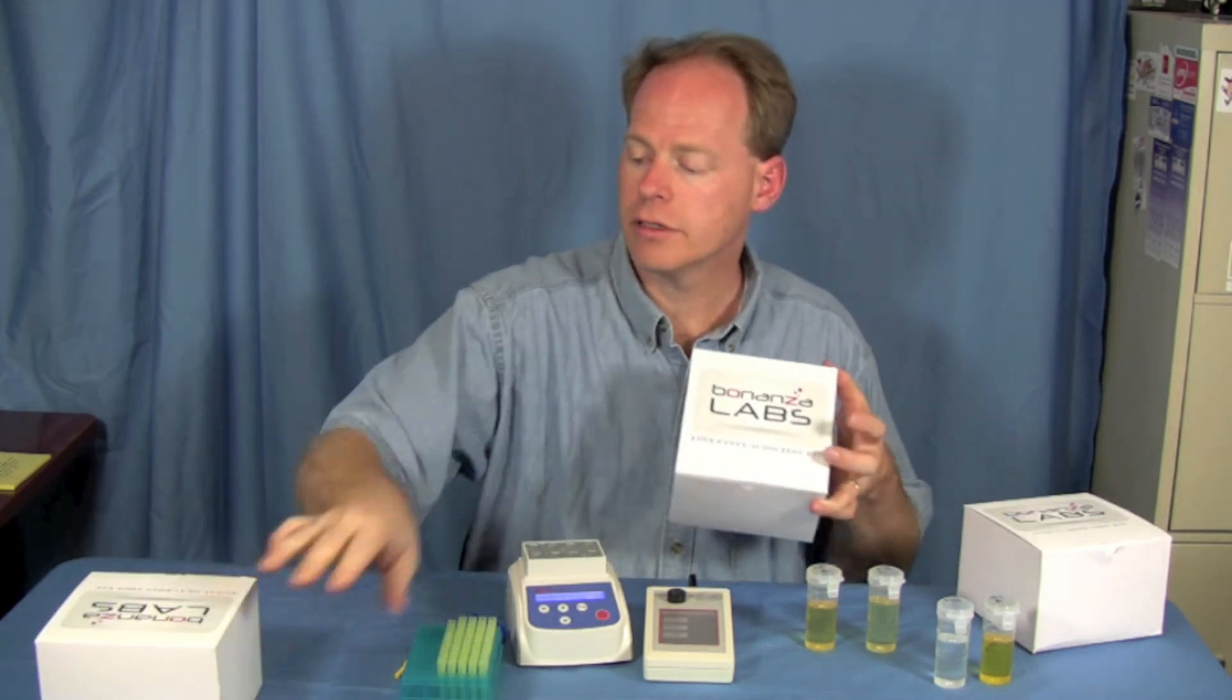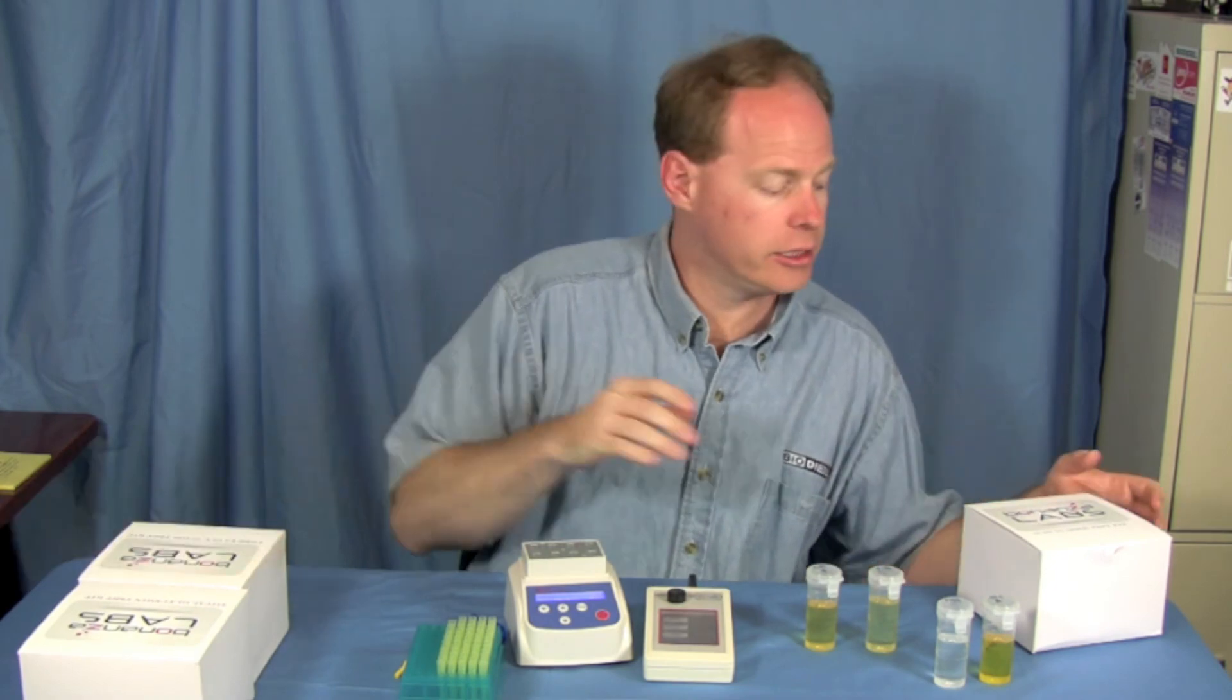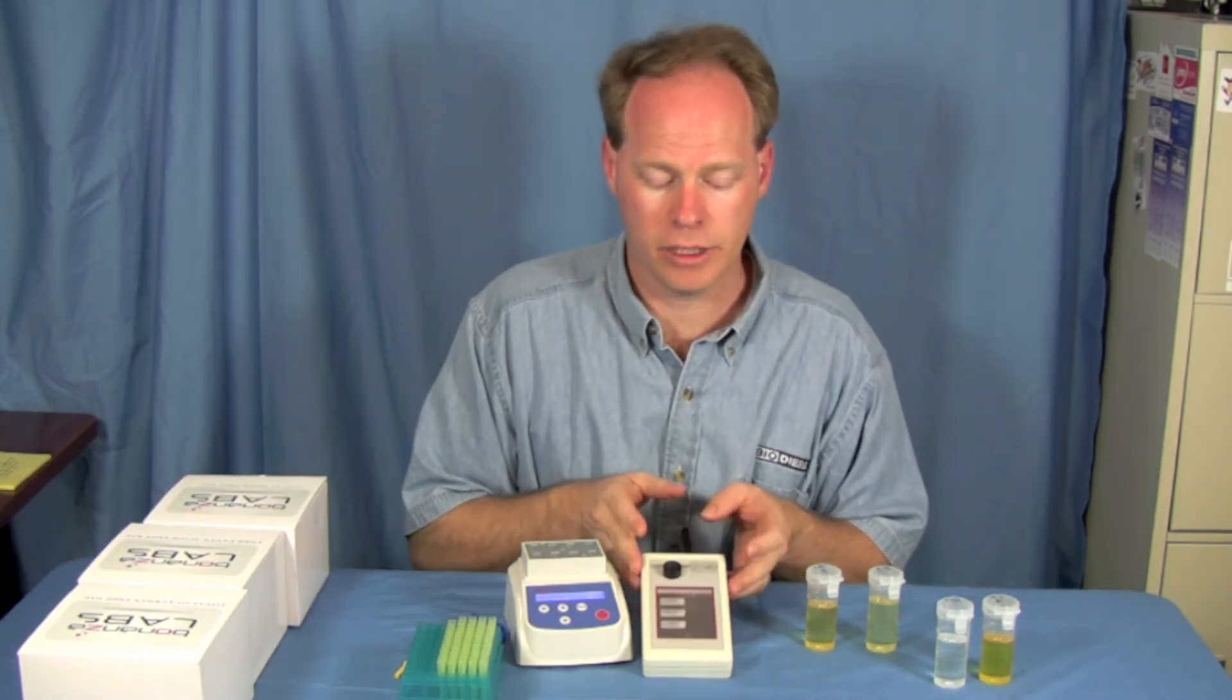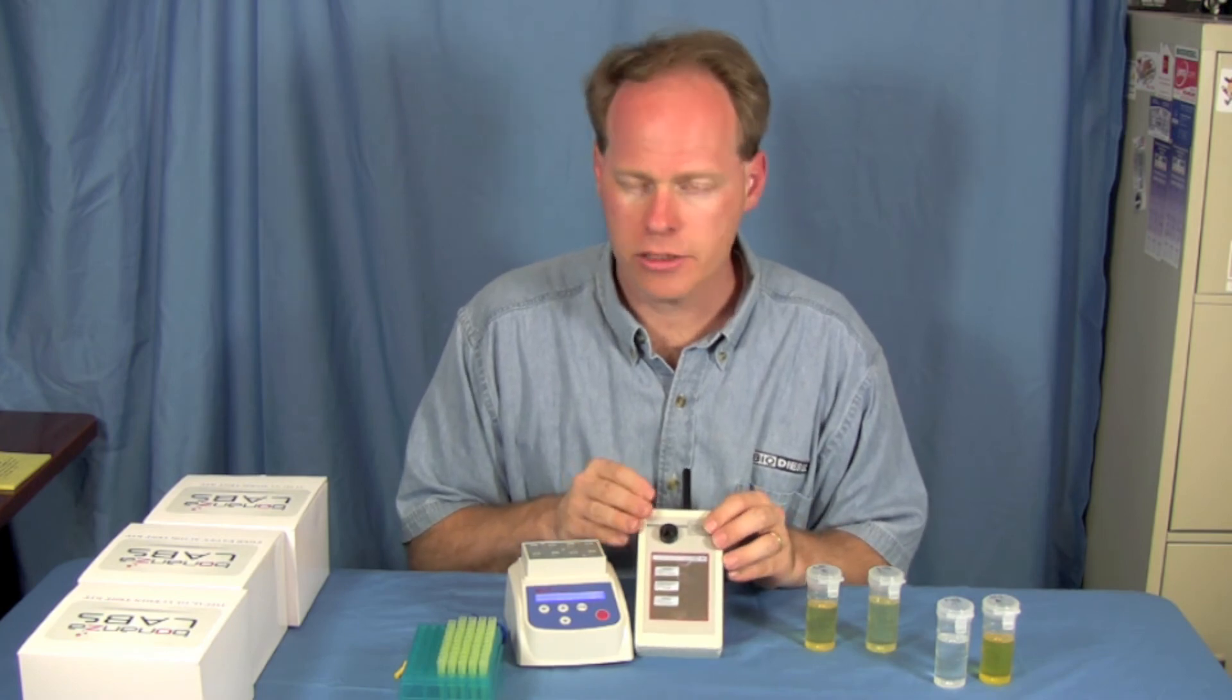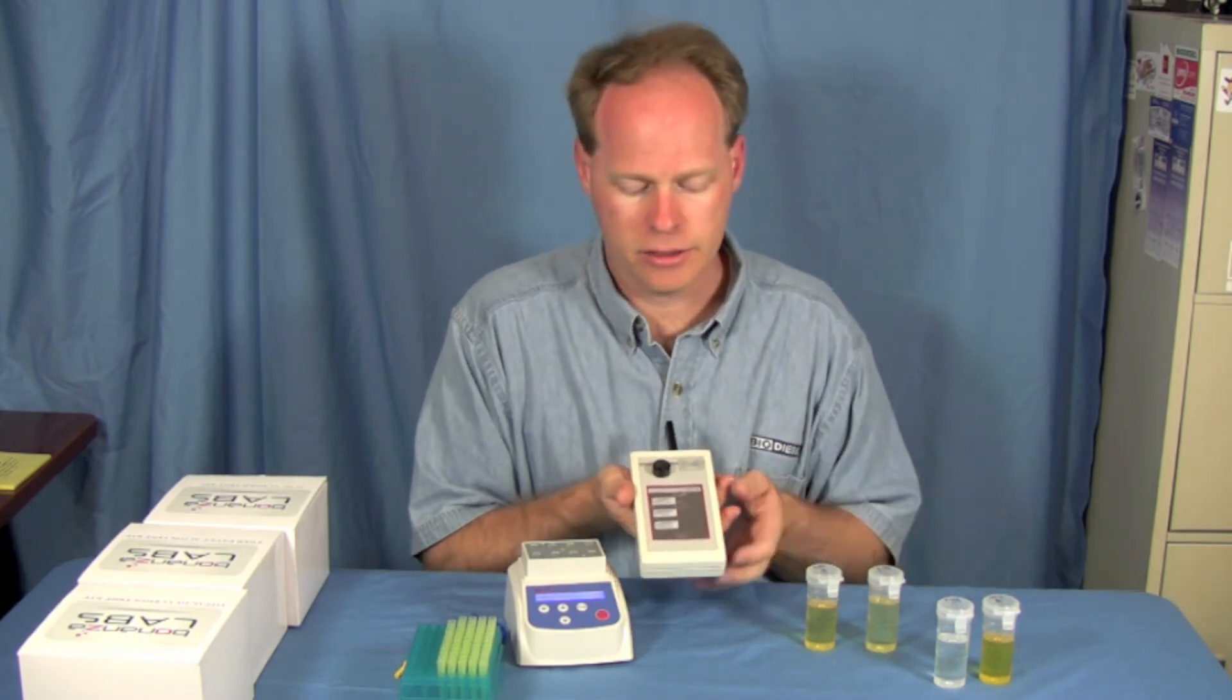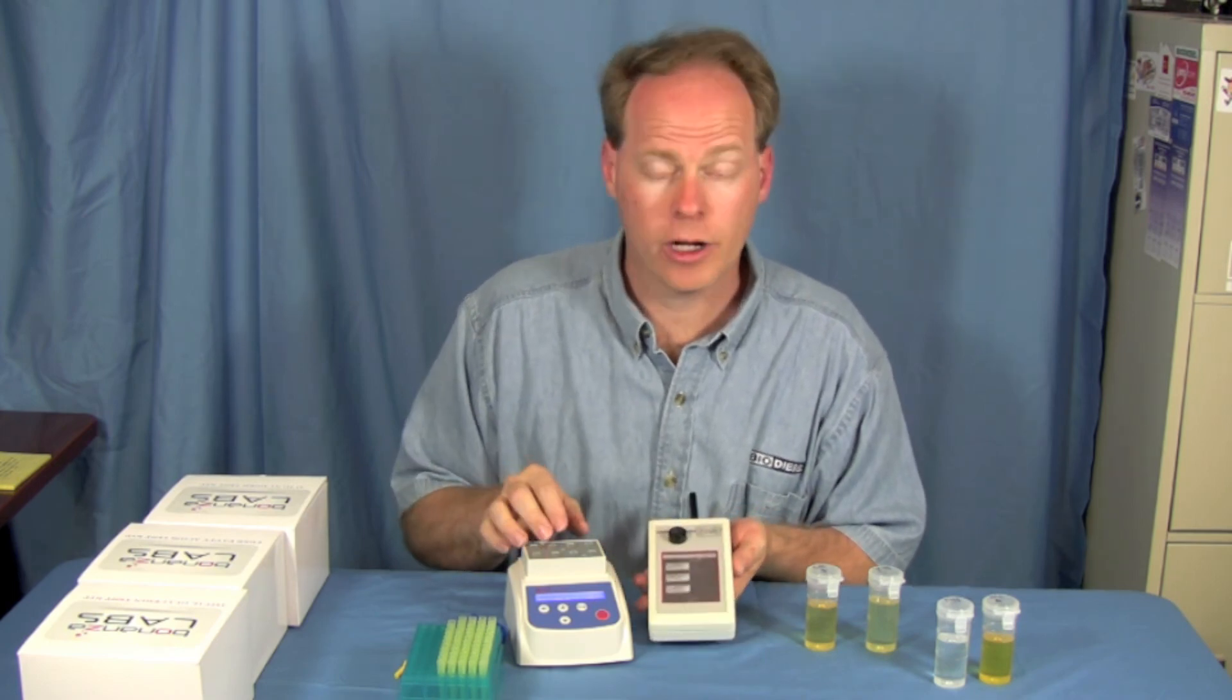Later on, it may even include additional tests, possibly a blend test that's being worked into it. But the tester is extremely accurate, convenient to use, very easy to test, and very repeatable.